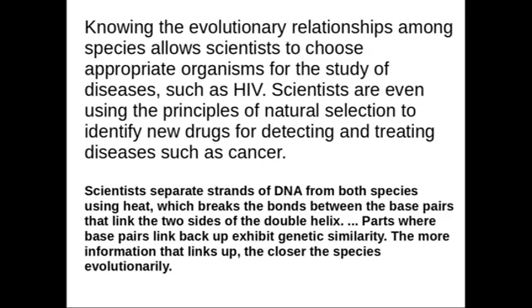So it is highly recommended that you work on an evolutionary tree to be able to know the sequences or organisms that are highly related to Homo sapiens, so that you'll be able to have good results, and then your results may be narrowed to maybe 80% result achievement within those two sequences. That means mouse and man.